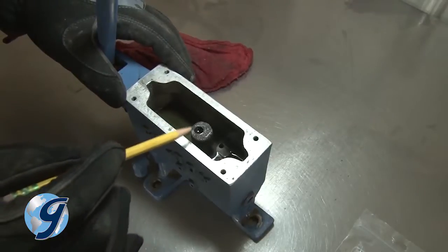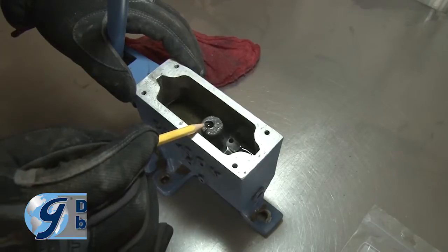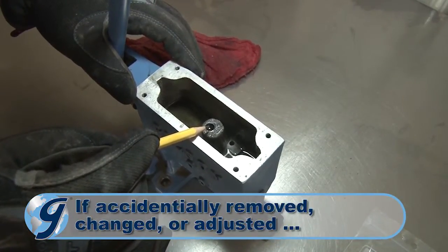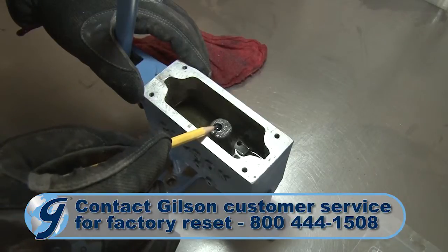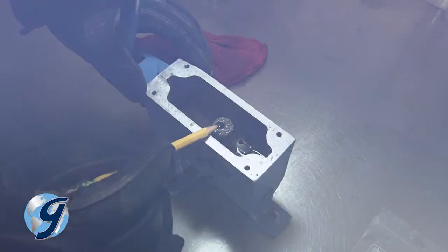It's important that you do not touch the bypass assembly. This is set at the factory using special fixtures and should not be changed or adjusted in the field. If you accidentally remove or adjust the bypass assembly, please contact Gilson customer service for instructions on how to return the pump to Gilson to reset the bypass assembly to factory settings.